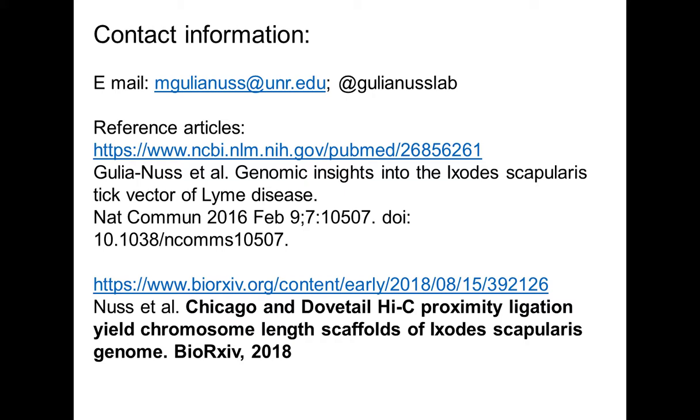There are 2 options there. Either you can risk running the scaffolding on your more fragmented assembly. We do have examples, and I think there was a slide in this presentation, of some projects where the N50 was lower than 20. I think we did the turtle project where it was, I think, 17 kb, and it worked really, really well. It's just that it's not as likely to perform as if you had a higher N50.